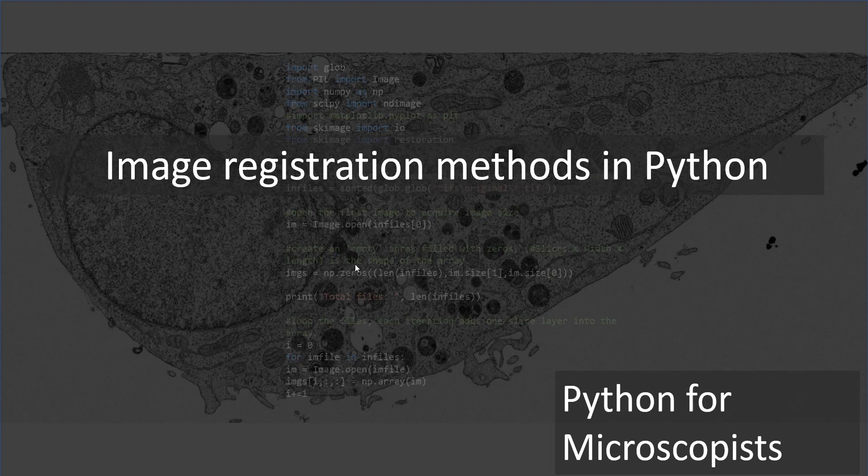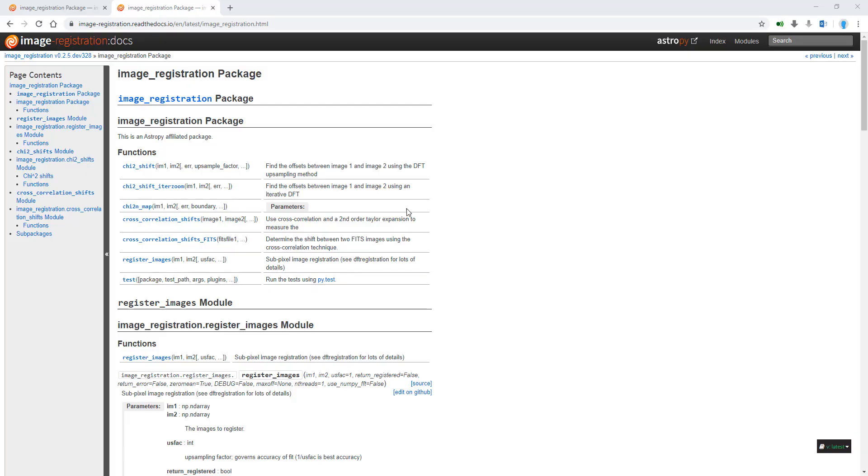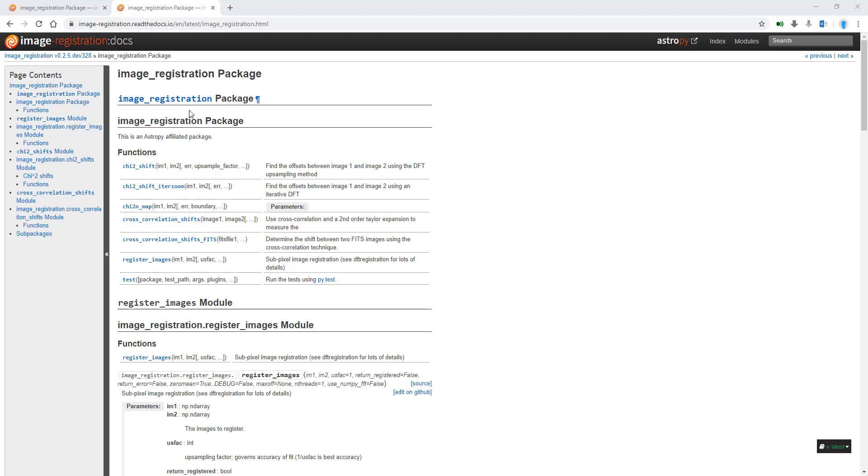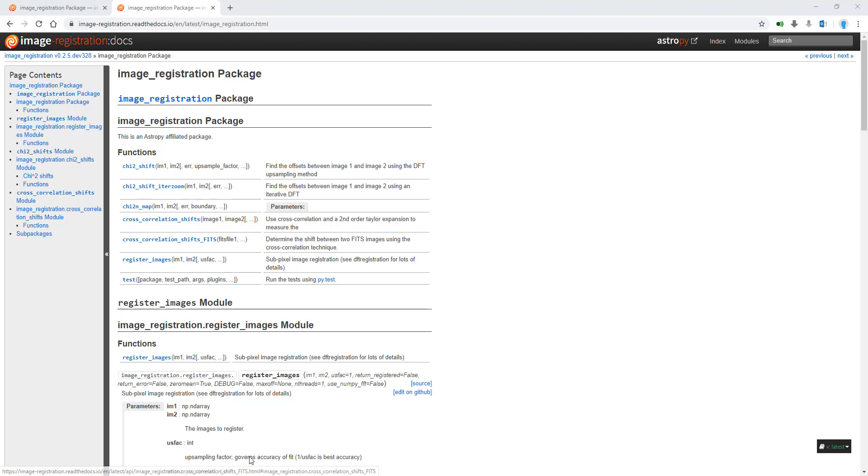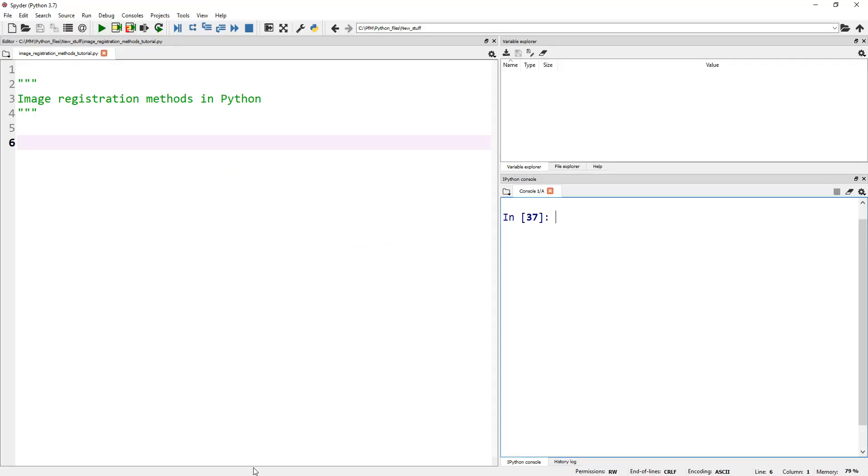Let's jump in. The first two methods I'm going to show you are inspired by our friends from the astronomy community. These are available under the image_registration package. Within this registration package, I'm going to use chi_squared_shift and cross_correlation_shift for our image registration. Let's jump into our Spyder IDE.